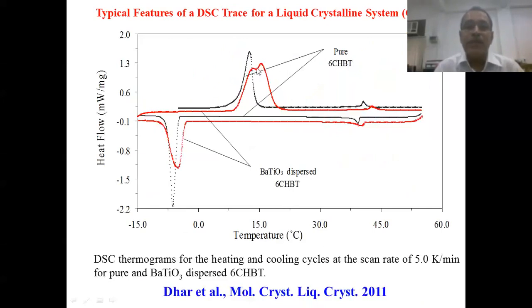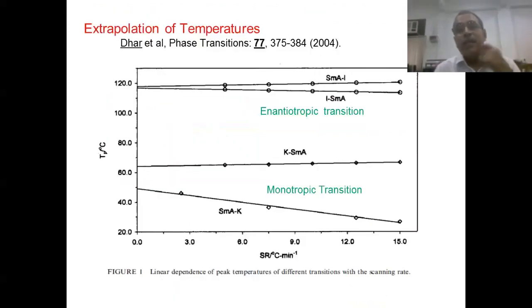So with different scanning rates. Different scanning rates means your heating rate or cooling rates are different. You can heat at the rate of 50 degrees Celsius per minute, you can heat at the rate of 10 degrees Celsius per minute or 2 degrees Celsius per minute. So by optimizing the scanning rate, you can bifurcate these kinds of heats. This is another important thing that I want to discuss in the thermodynamical analysis. The time is restricting me from discussing this. But if you can understand, then try to think about the process of thermal equilibrium and quasi-static processes.